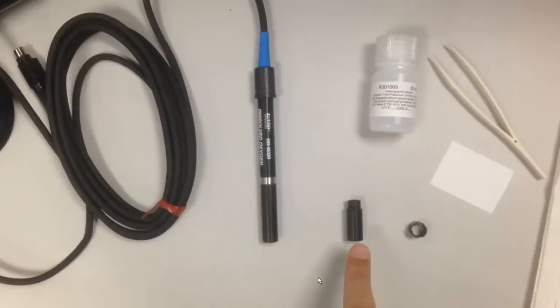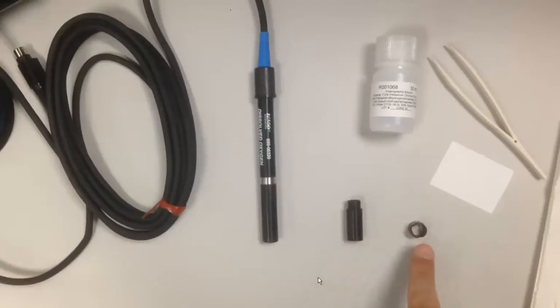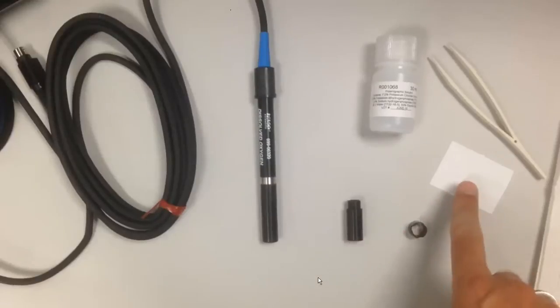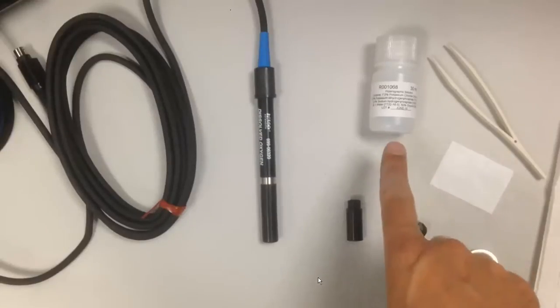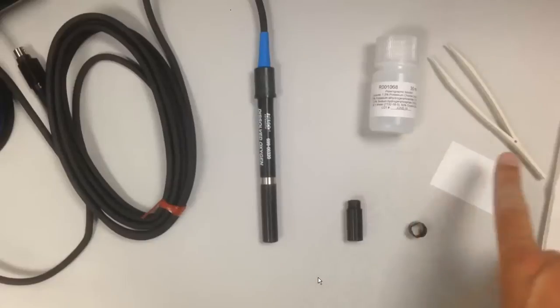We have the probe head, we have the replacement cap, and the end cap, the membrane, polarographic solution, and tweezers.